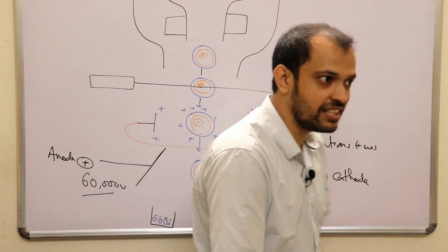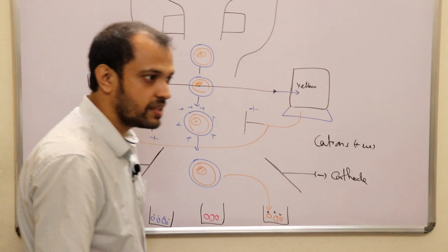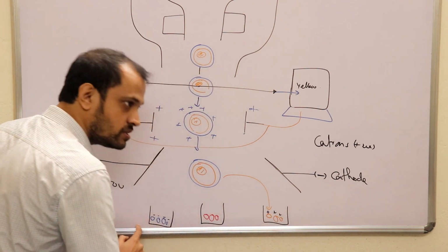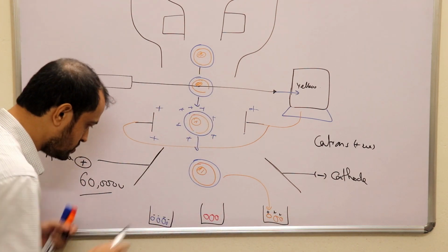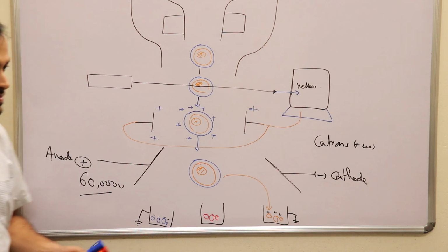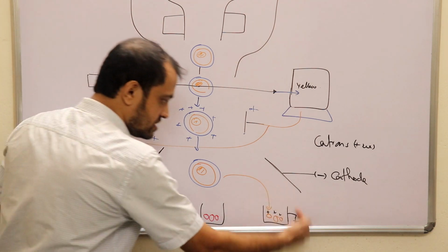There is charge in this particular solution. So in the lab, we connect these tubes to ground, so that the charges flow to the ground.